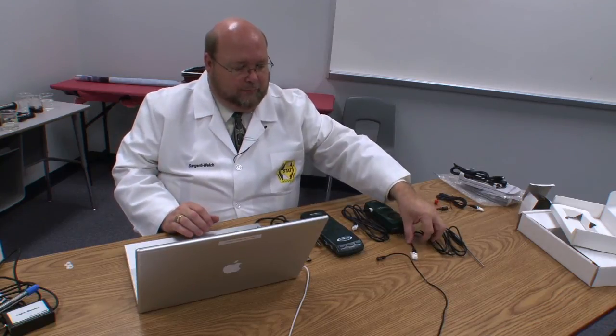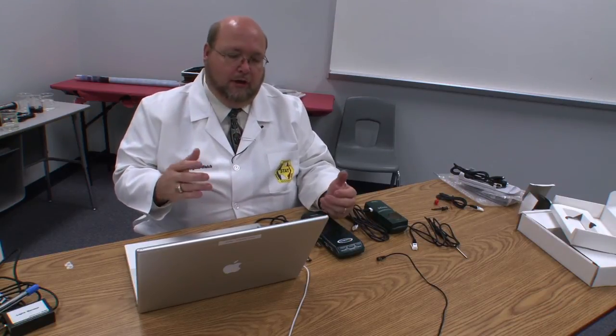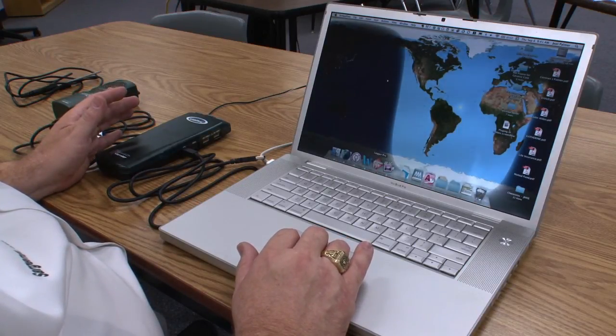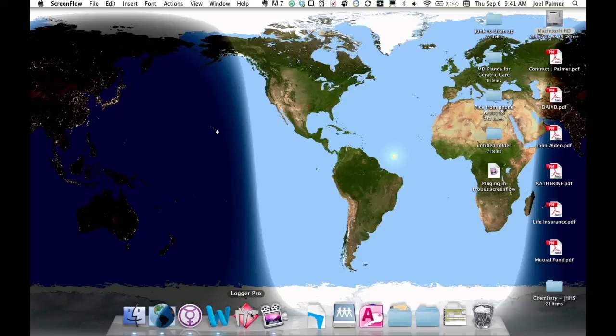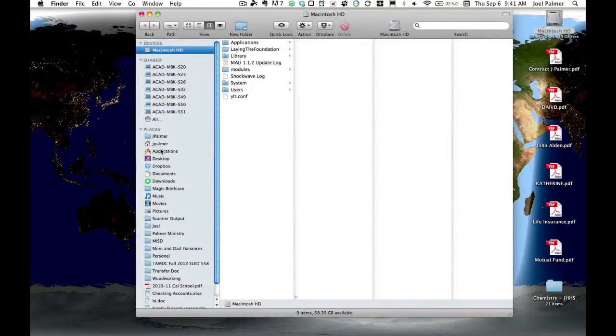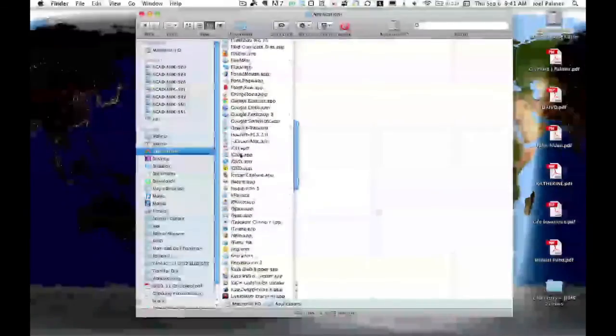One of the nice things about the LabPro device is that it's very simple to use and very simple to connect to your computer. You can launch the software first, or connect everything up and launch the software afterwards. Logger Pro should be installed on all teacher and student computers. Its icon looks like a little caliper on a red diamond. If you don't find it in your toolbar, simply go under Applications, scroll down to Logger Pro, and run it from there.